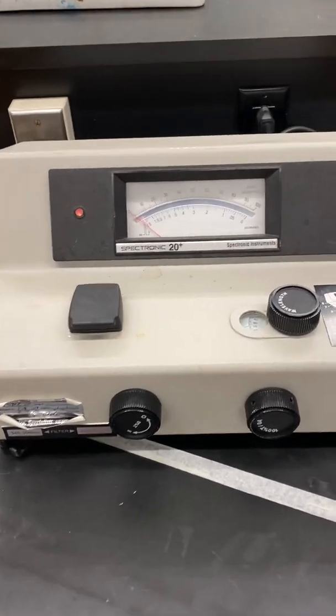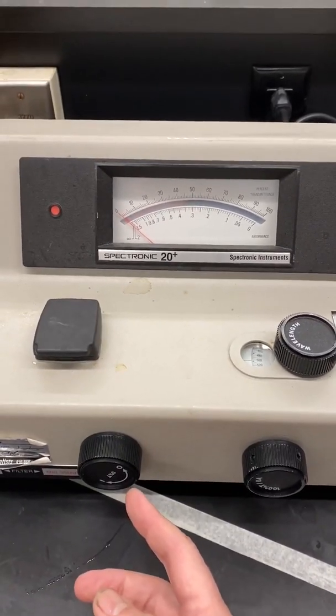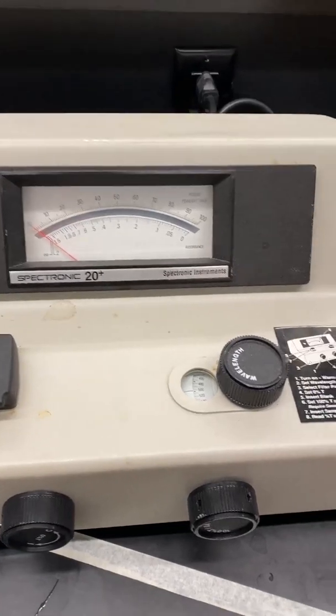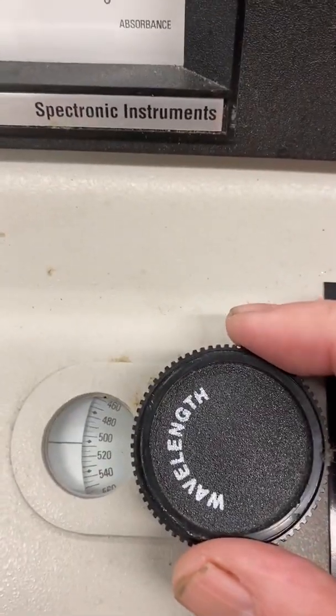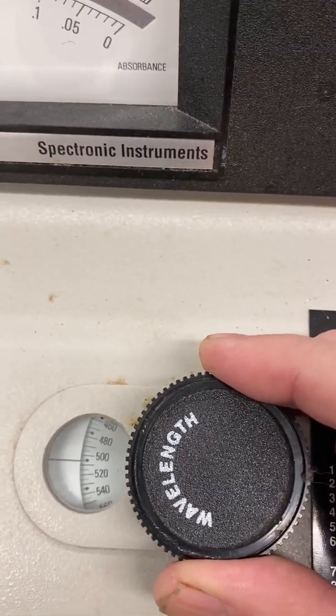In part 3, we are now ready to use the spectrometer. The spectrometer should have been turned on before you arrived at lab so it had time to warm up. The first thing we want to do is set the wavelength to 508 nanometers using the wavelength knob.